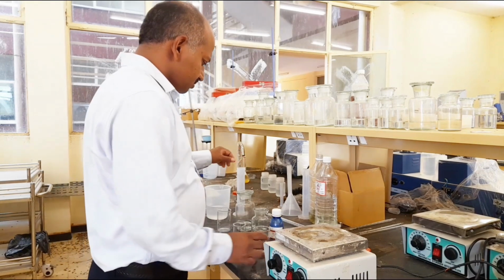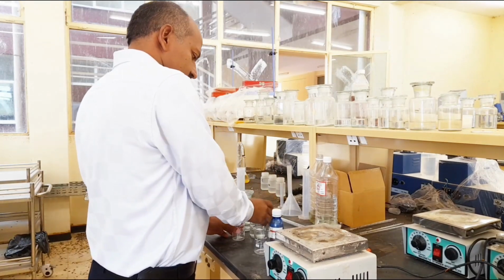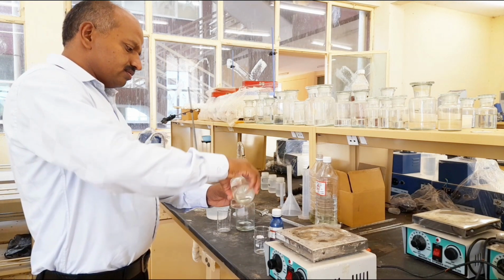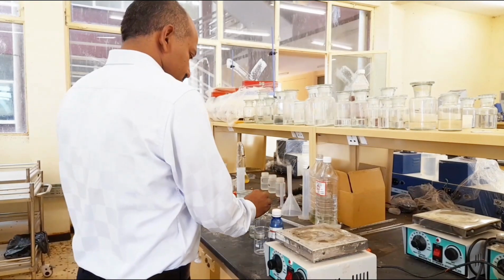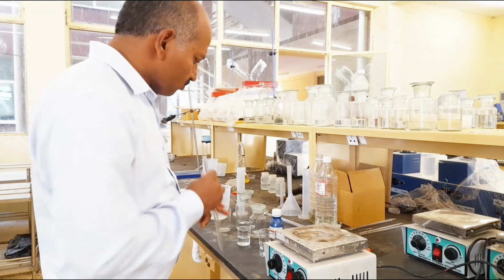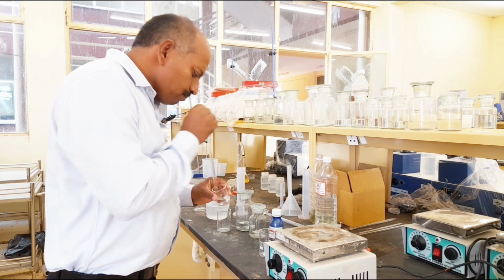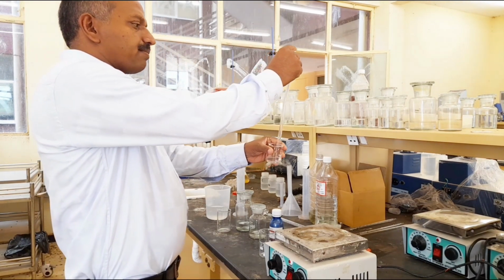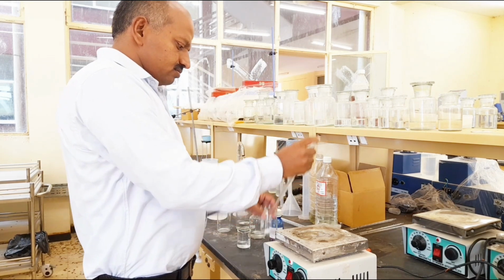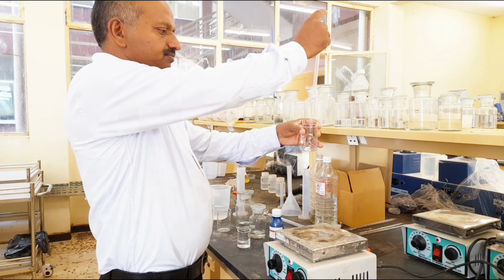So this is the beaker. Now I will take the mixture into the small beaker. Now this is the pipette, already washed. I will take 10 ml of the mixture. So this is the 10 ml capacity, right? I have taken 10 ml of the mixture containing sodium chloride and sodium hydroxide.